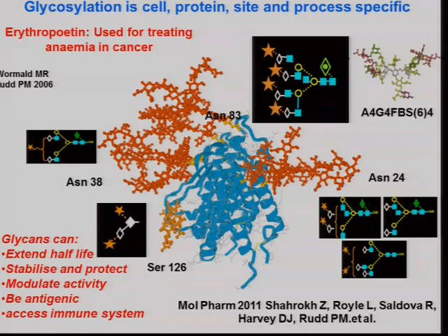I saw a paper came out the other day where somebody was doing sialylation, actually, and they were post-expression putting on galactose and sialic acid. So, you can make your IgG, and then you can try to add galactose and add sialic acid. And, I mean, you can make it work, but it's not... I've tried it. It's not exactly trivial, but if you get the right conditions, it can be done.